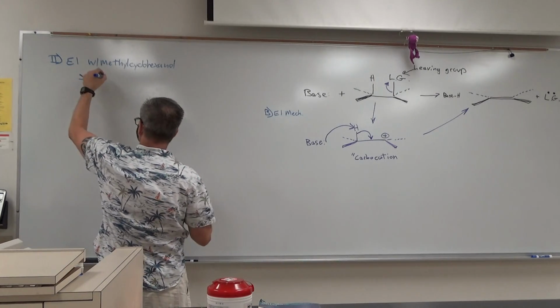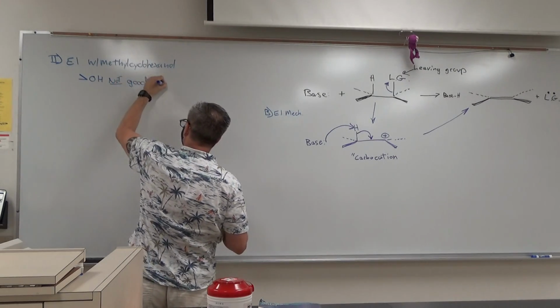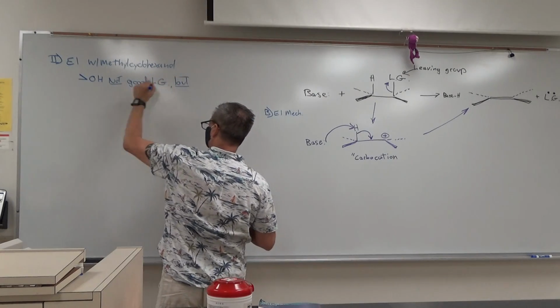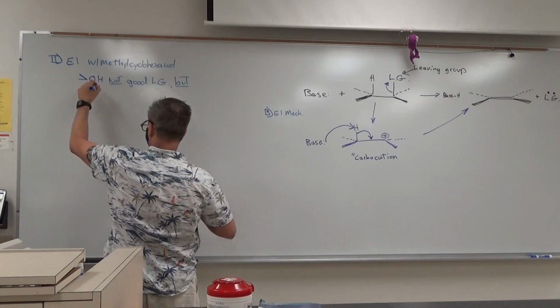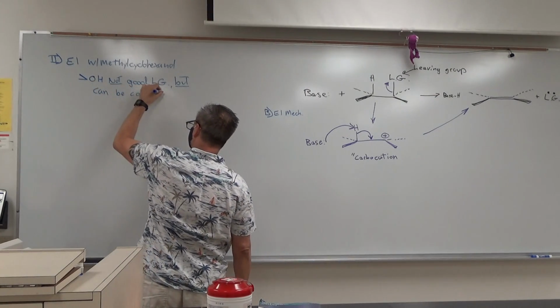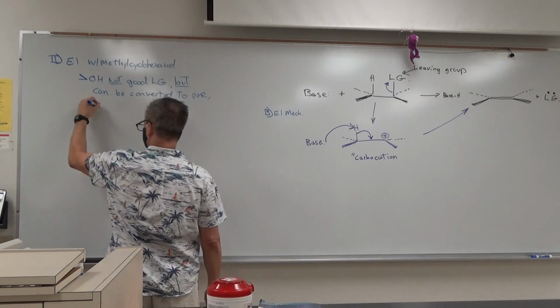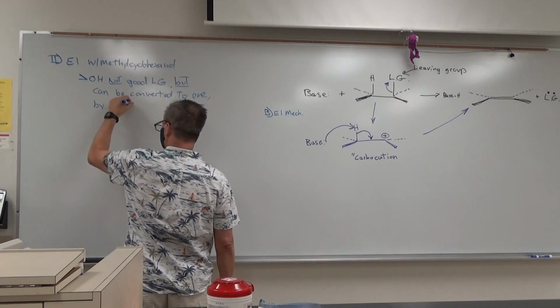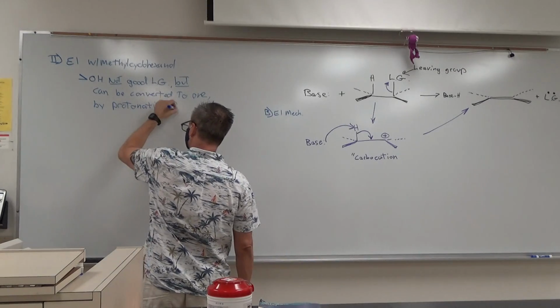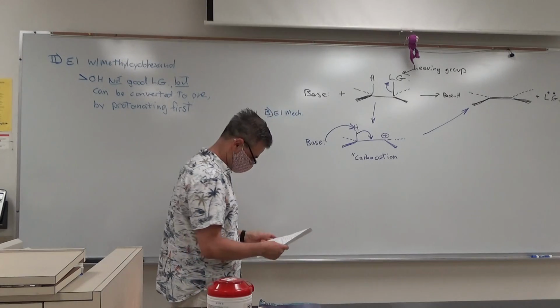So OH is not a good leaving group, but it can be converted to one by protonating first. That's exactly what we're going to do here.